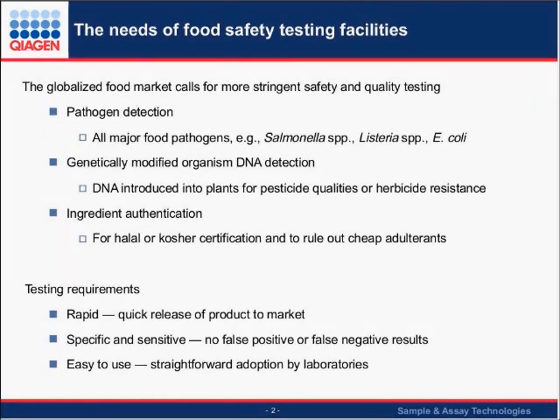We are going to discuss the needs of food safety testing and environmental testing. What is it that people need, and how does real-time PCR fit into this testing paradigm?